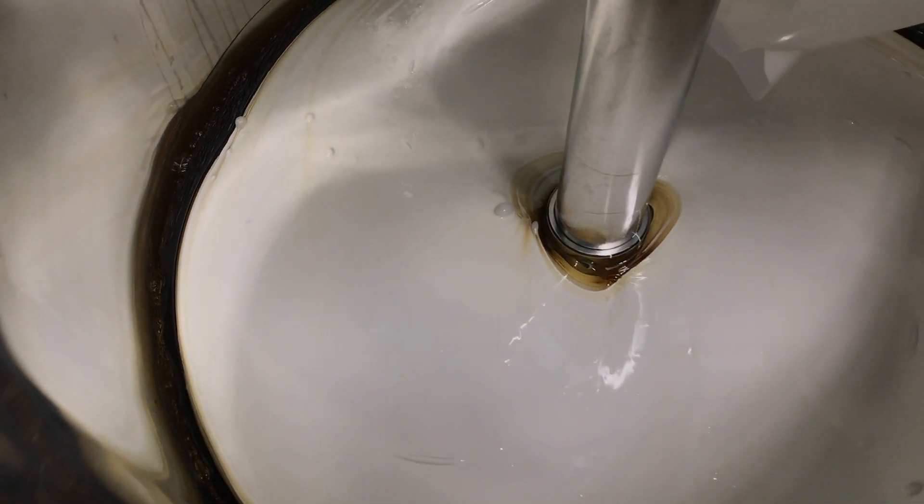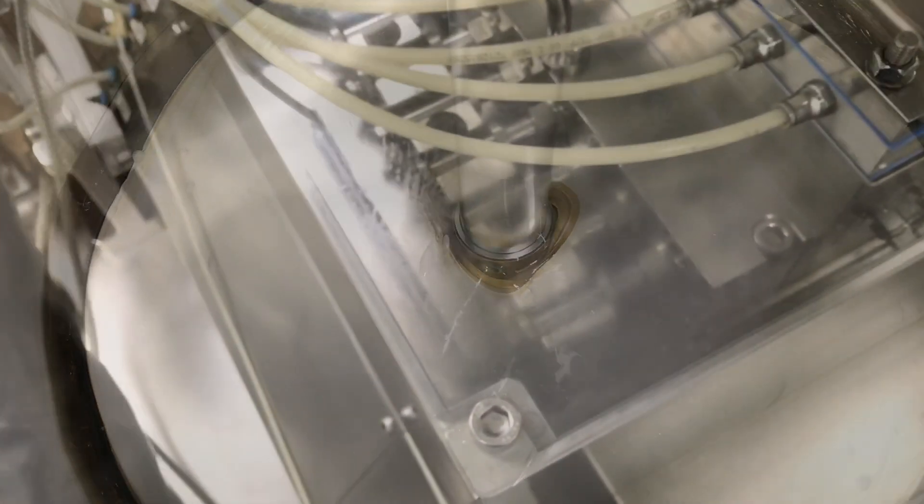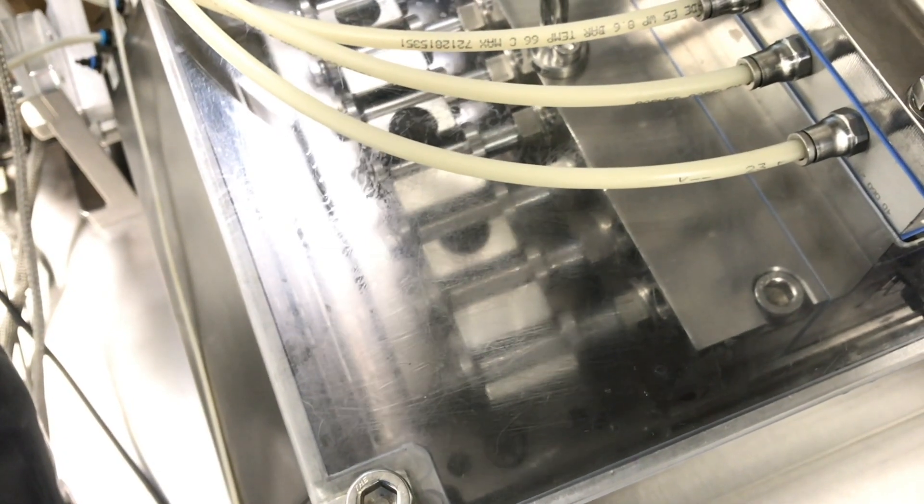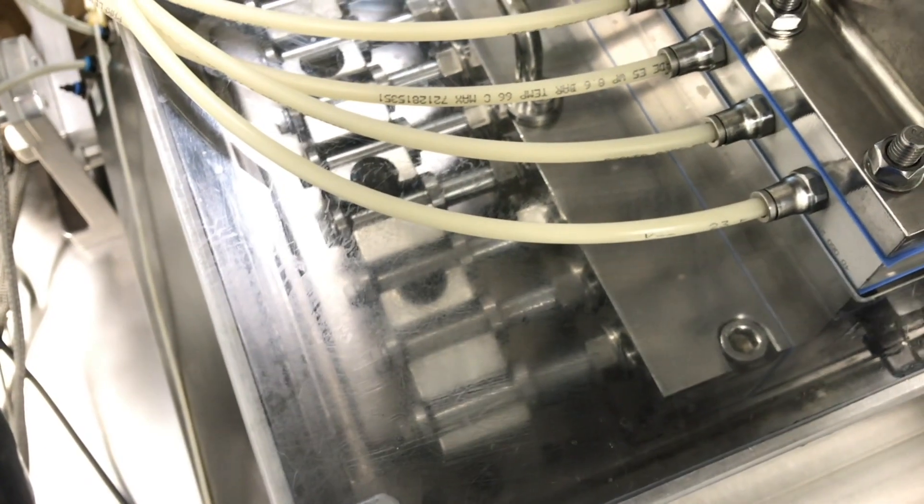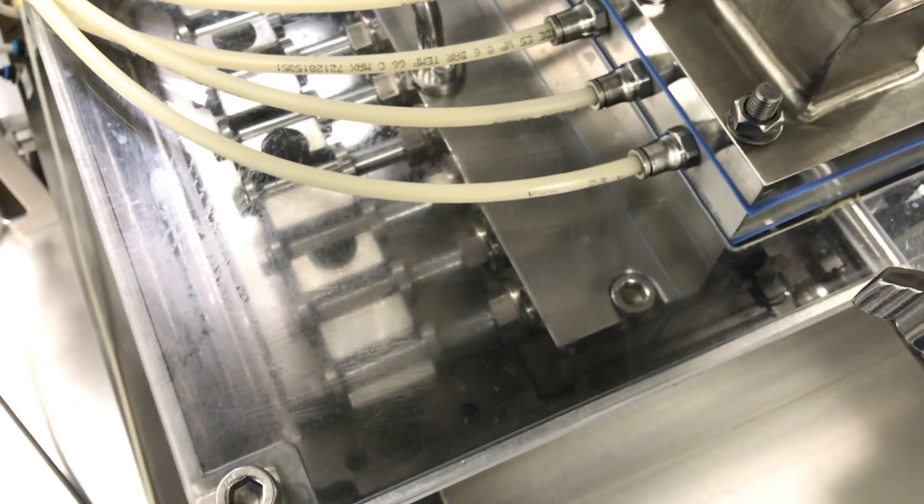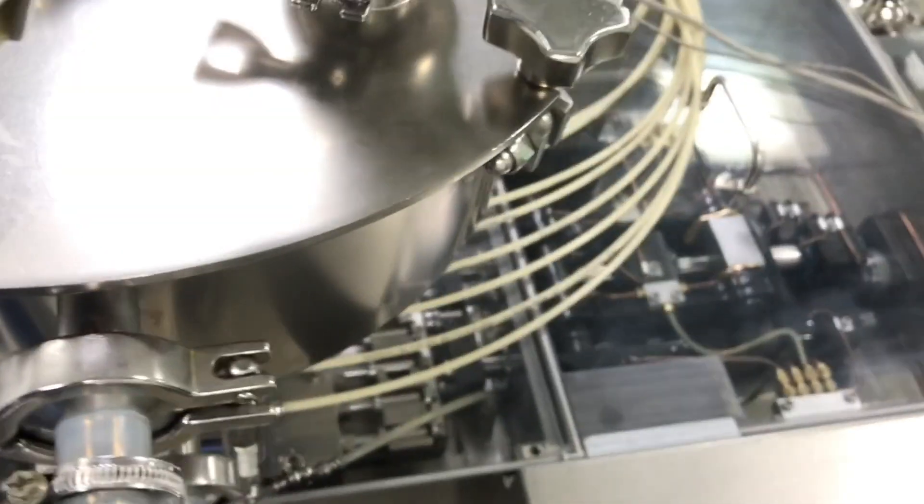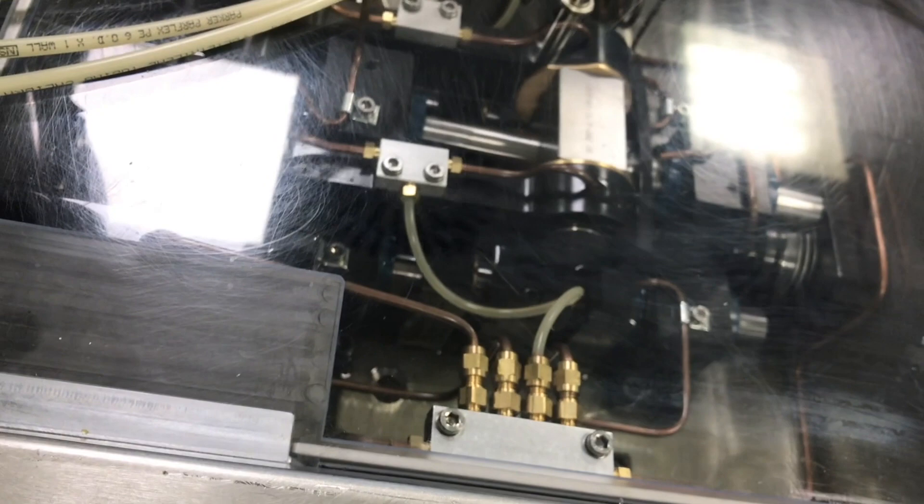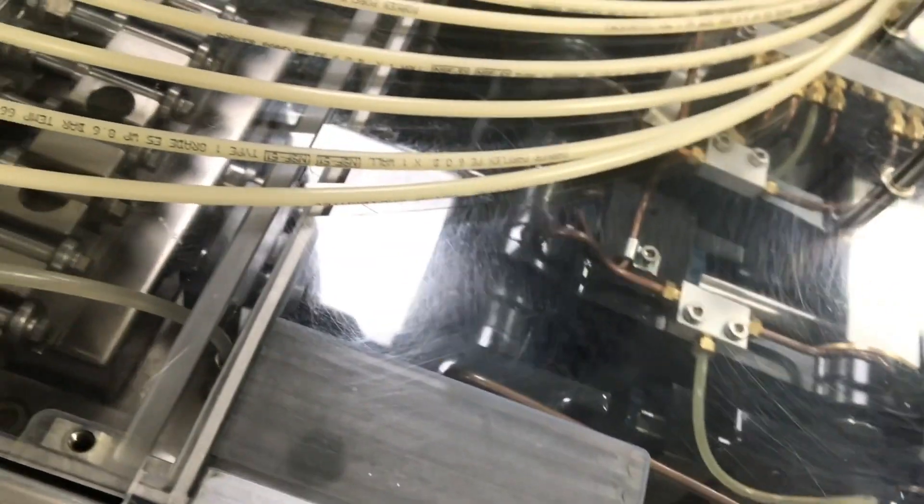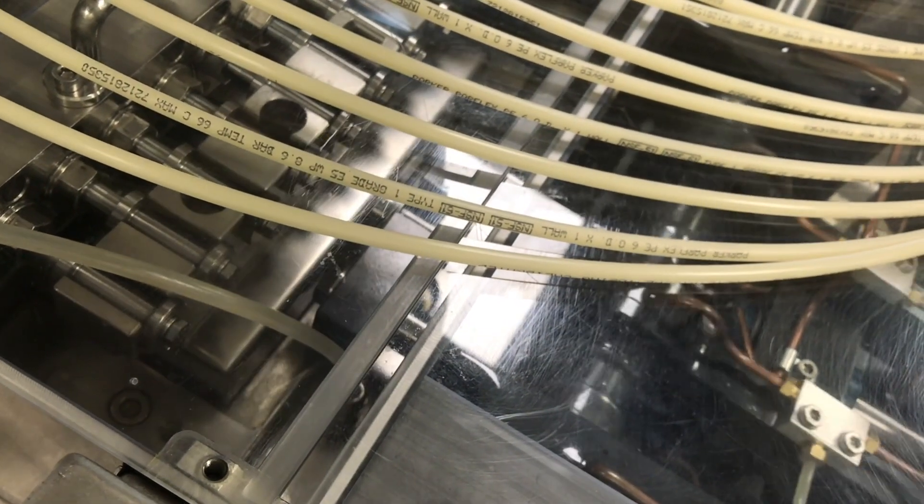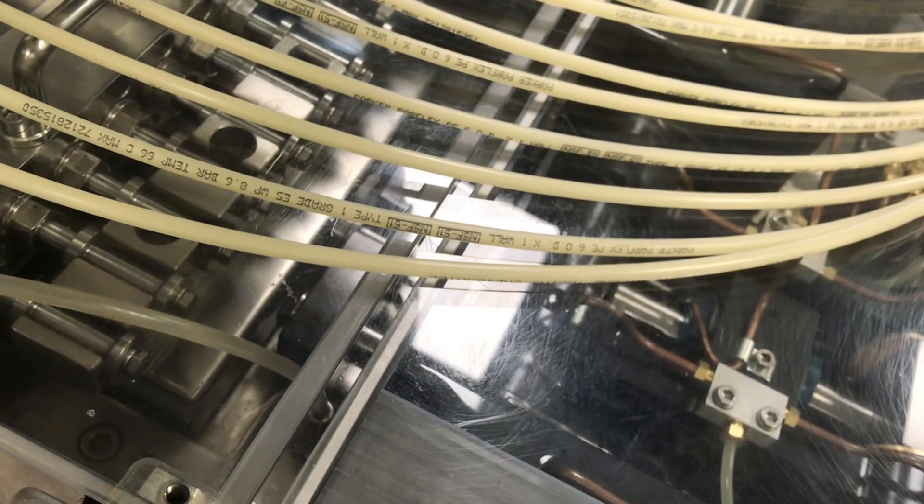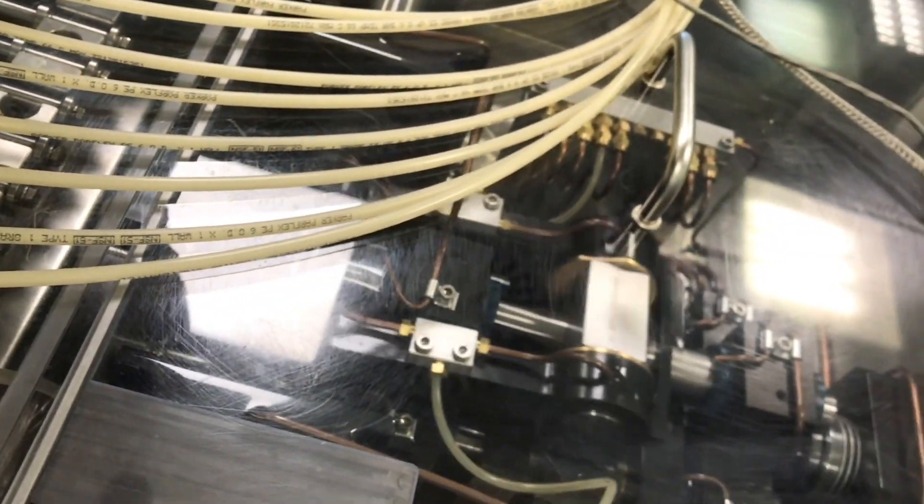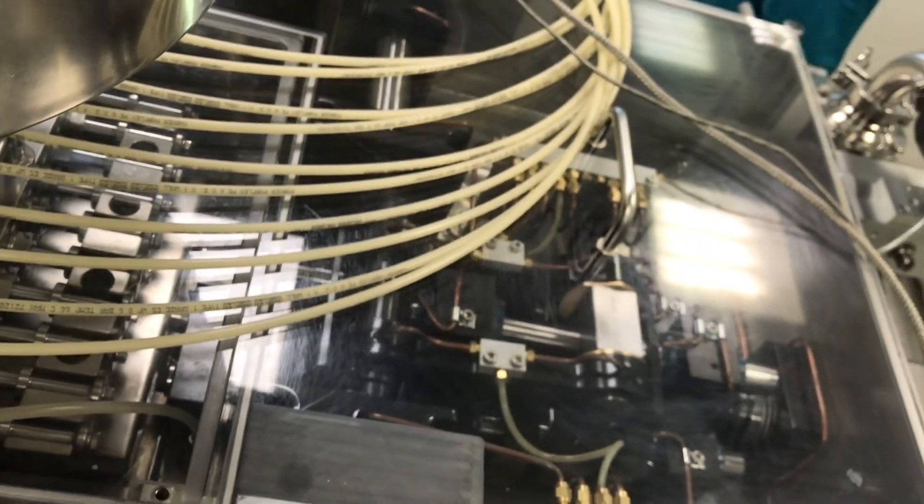And now this is a closer look of the encapsulation machine. You see the pumping block where the pistons volumetrically dose the fill mass. The distance that the pistons go corresponds to the actual volume.